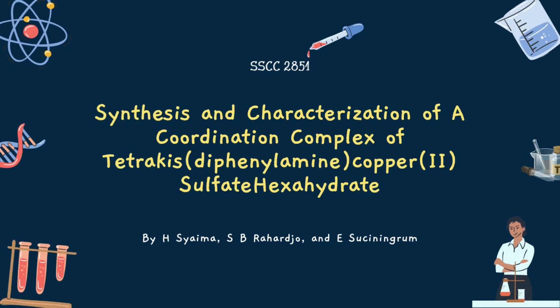We are from Group 4 and our topic is the synthesis and characterization of a coordination complex of tetrakis(diphenylamine) copper(II) sulfate hexahydrate.